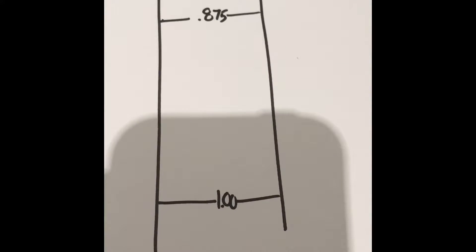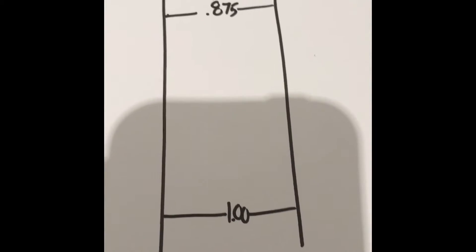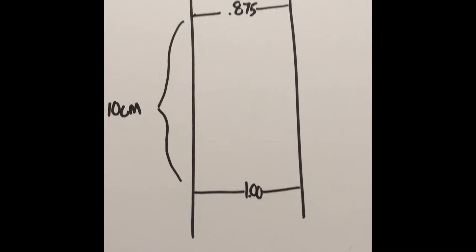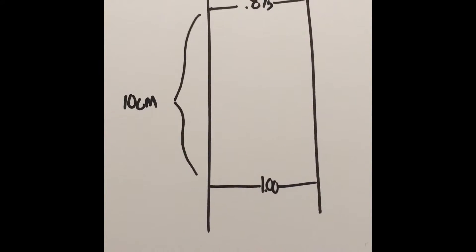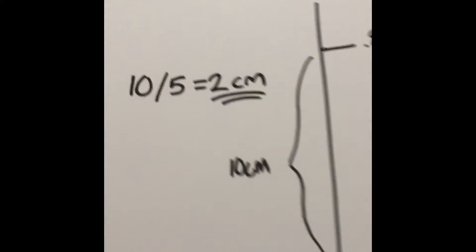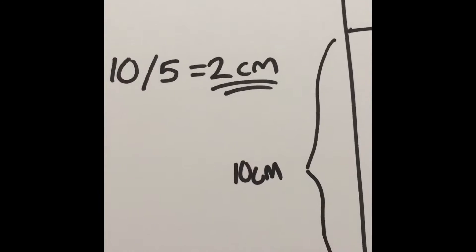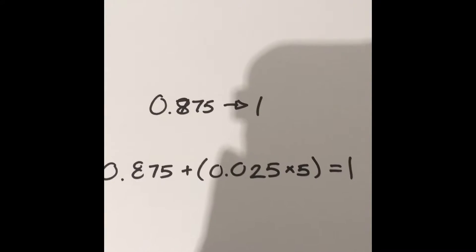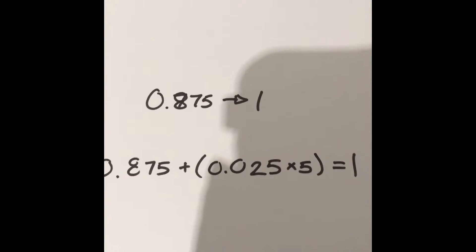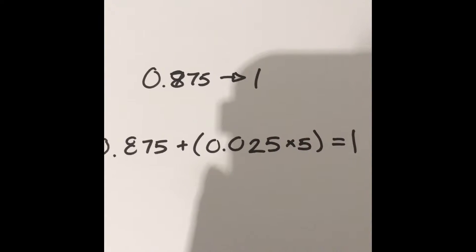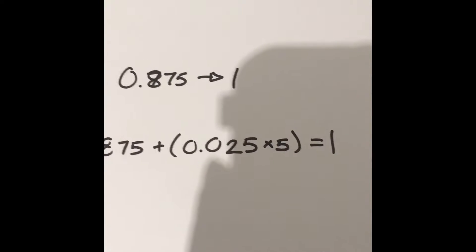Now that you have these two points marked, you can find out the rest of the scale. To do this, measure the distance from your first mark to your second mark and divide that number by 5. We're doing this because to get from 0.875 to 1, you have to add 0.025 five times.